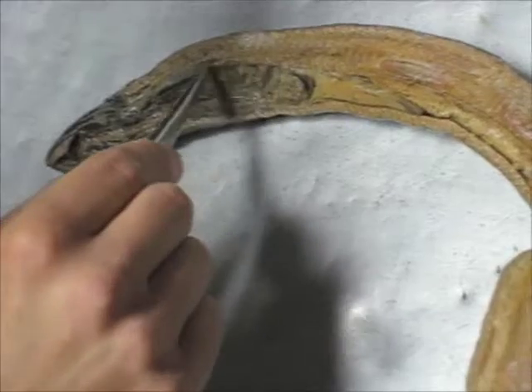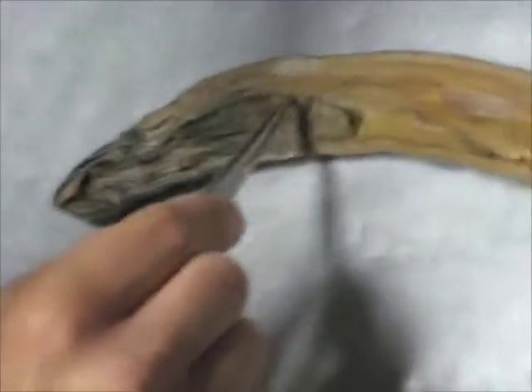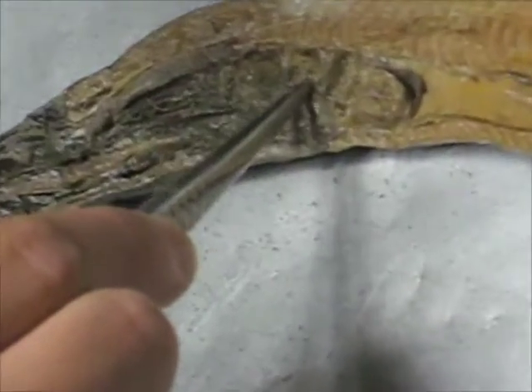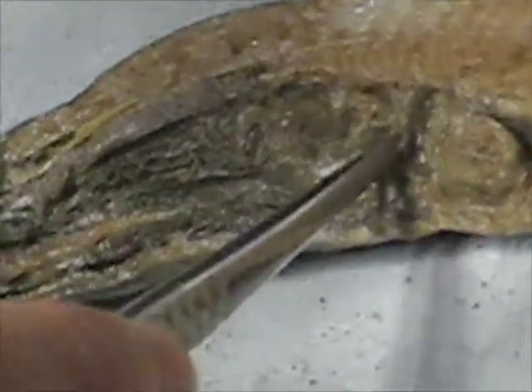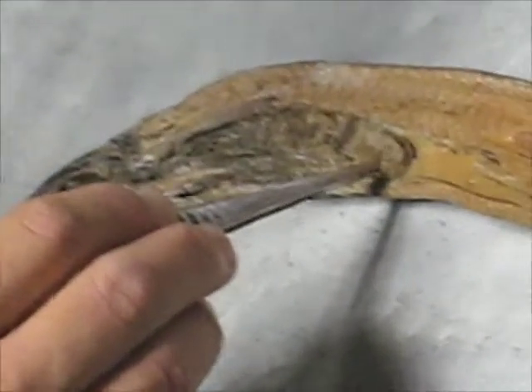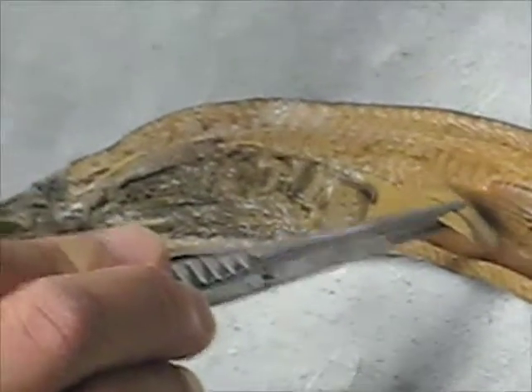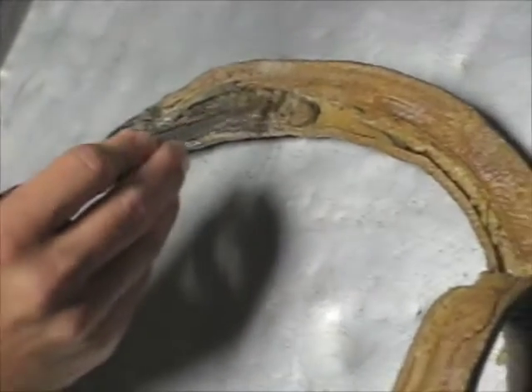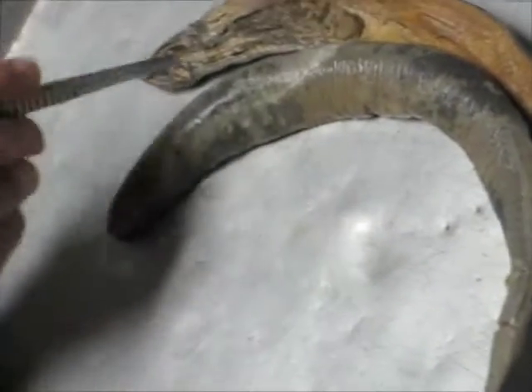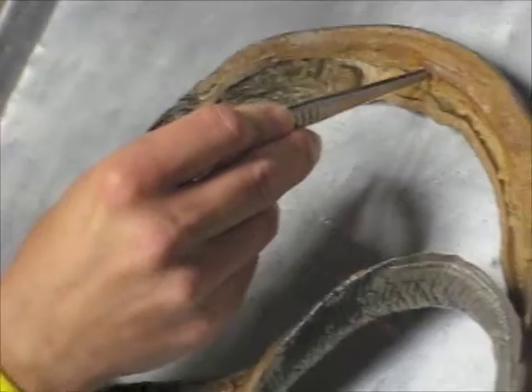All right. This area right here is the pharynx. So you have the internal gill slits right inside. As we're coming back, you can actually see the heart right here. Behind the pharyngeal gill chamber is the heart, and behind that you can see the liver. So you've got the internal gill slits, and then the external gill slits on the outside. There's a groove right here.